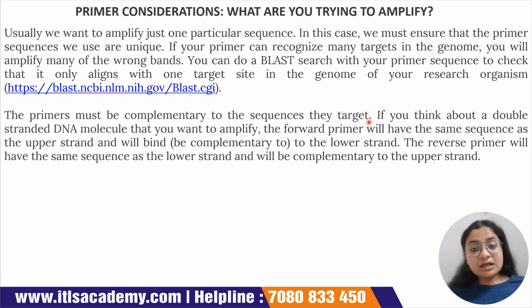That's why it's very important, because the PCR primer has to be designed by us ourselves. Okay, we have to design the primer on our own, whether it's the reverse primer or the forward primer. So in order to design a primer, it's very important to know what we are trying to amplify. So we need to have a clear idea about our gene of interest. And the sequence of the gene of interest, our DNA sequence, we must know very well; only then can we find and design primers. Okay.